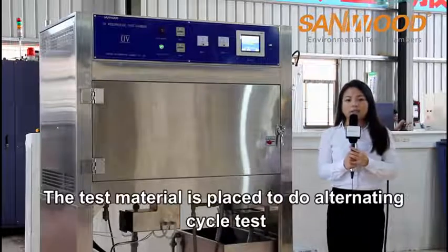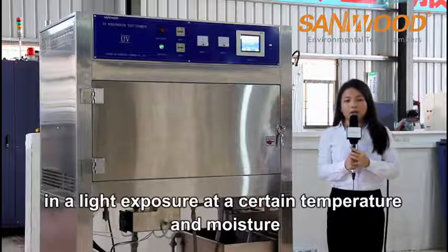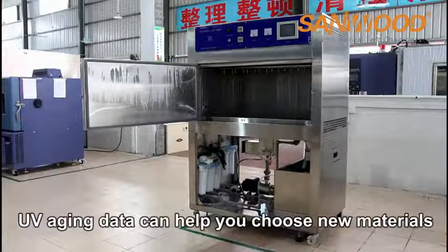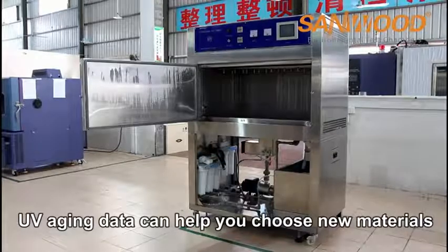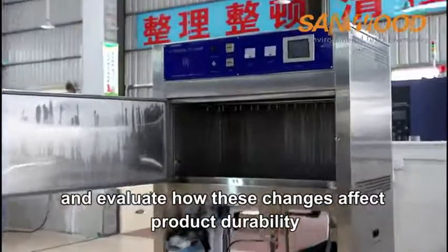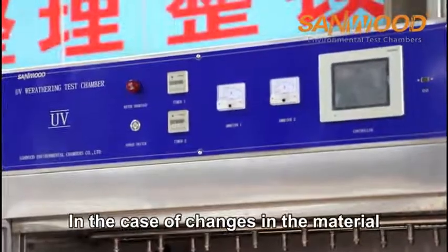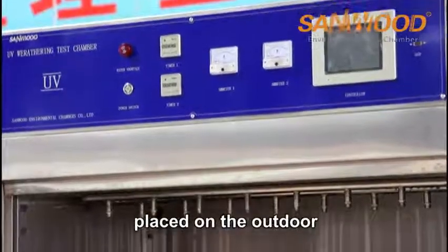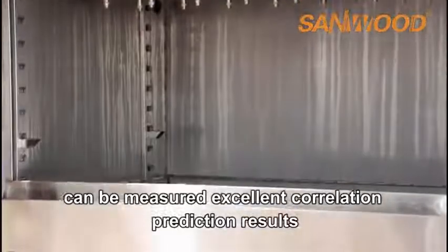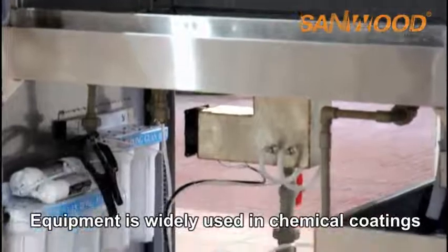The test material is placed to do an alternating cycle test in light exposure at a certain temperature and moisture. UV aging data can help you choose new materials, improve existing materials, and evaluate how these changes affect product durability. For materials placed outdoors, the UV accelerated aging test chamber can provide excellent correlation prediction results.